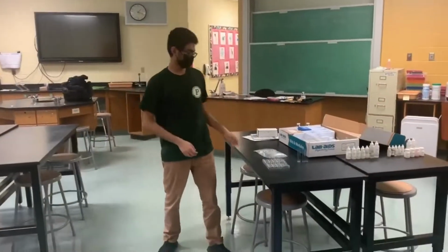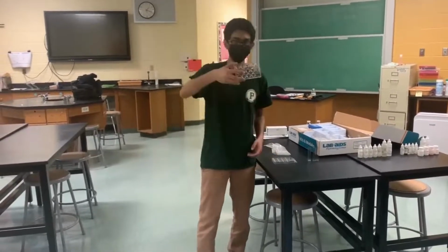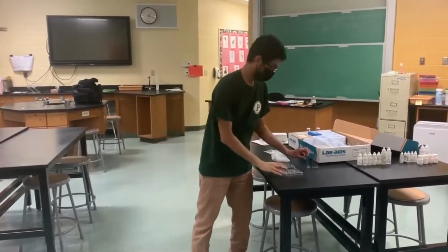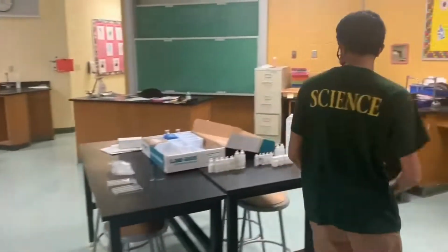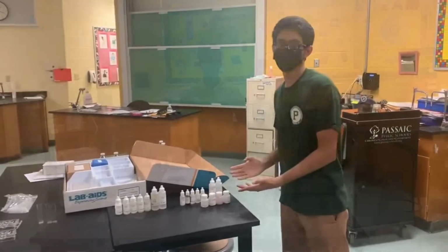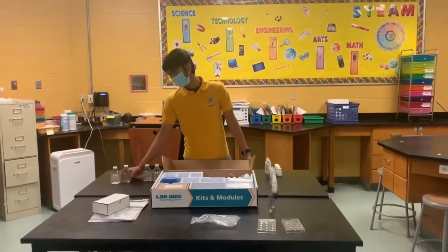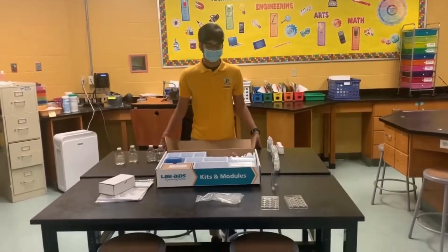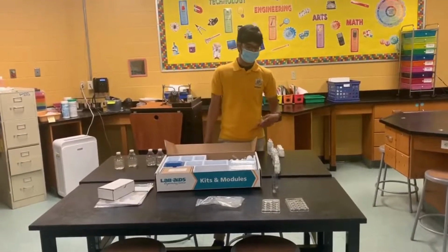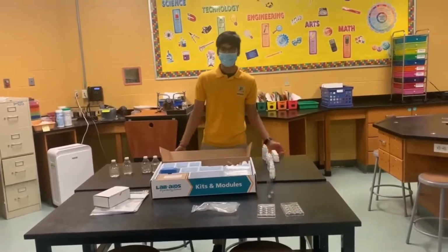In this kit, we use the pipette, the chem plate, the calibrated tubes, and most importantly, the test solutions. What we did was take water samples and put certain amounts of water into either chem plates or the calibrated tubes, and then added the test solution and the test indicator powder to them to notice any observable pattern.